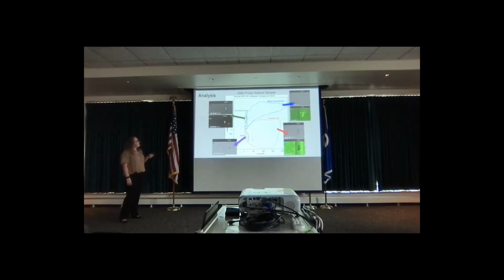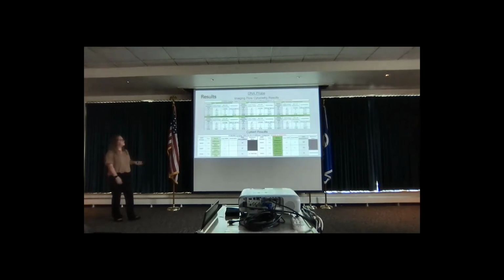But the probe-stained cells all look like this or a little smaller, and they're all stained with the probe and weren't clumping. These were more beads that ran in the background, and then this cell is unstained, and all the cells in that area were, because there is no DNA probe, so therefore it's not E. coli. So these are the results from running that test with the probe.